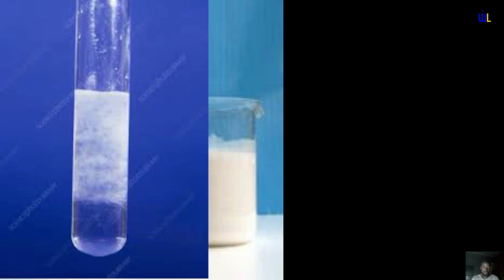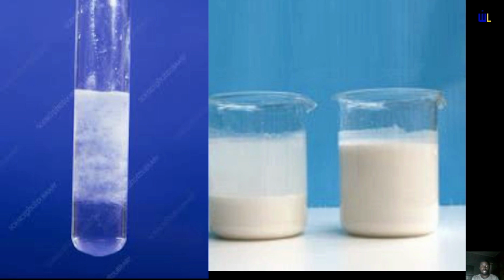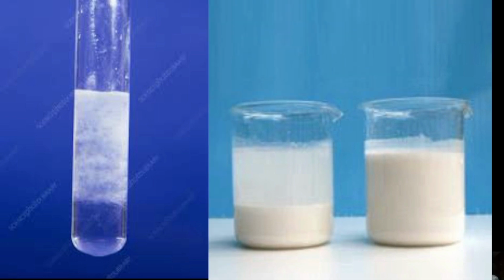A gelatinous precipitate is more like, the term I like using is hanging precipitate. So if you notice this picture now, you will notice that the precipitate is more or less hanging, unlike the chalky precipitate. Let me bring that up. So if you notice the chalky precipitate more or less sinks to the ground or to the base of the beaker.